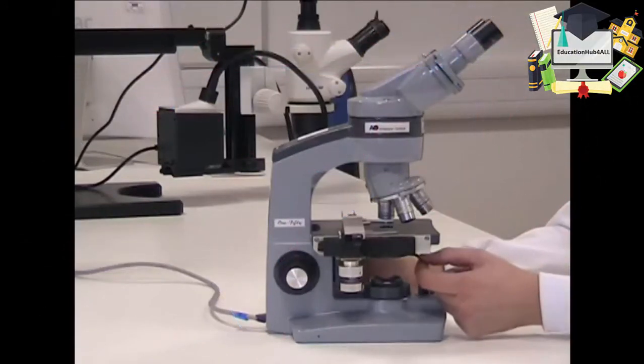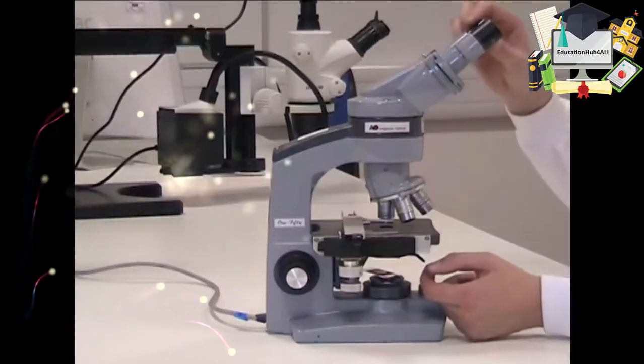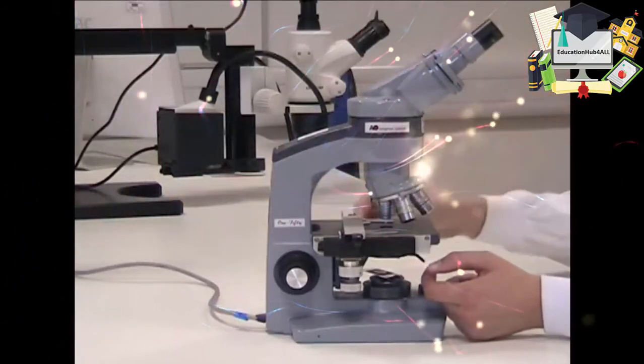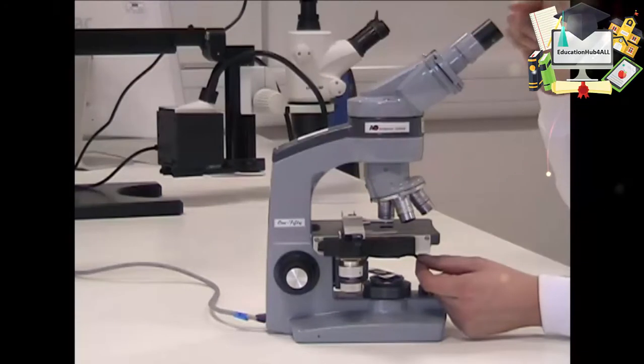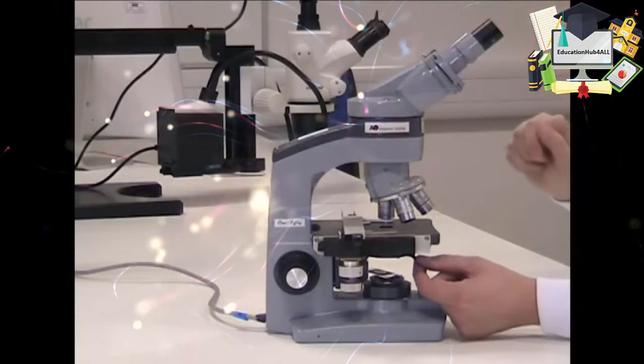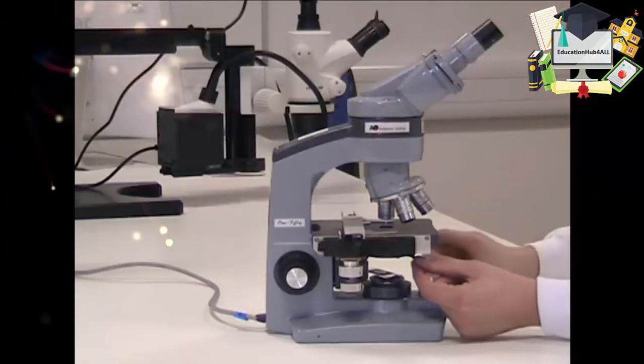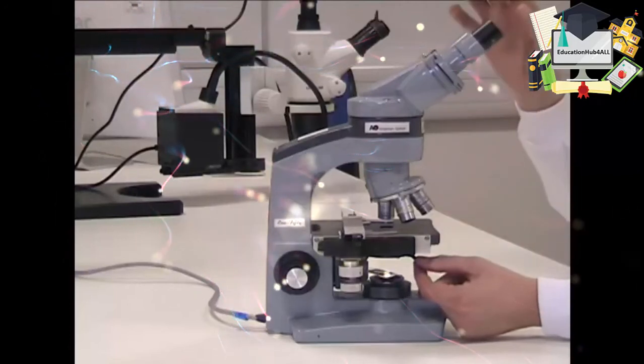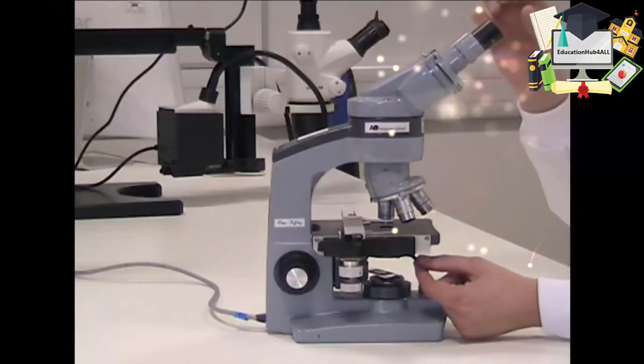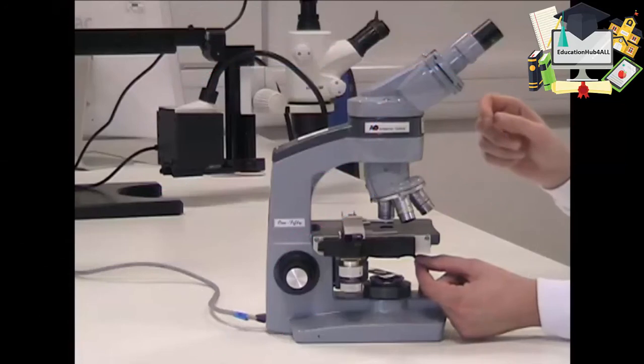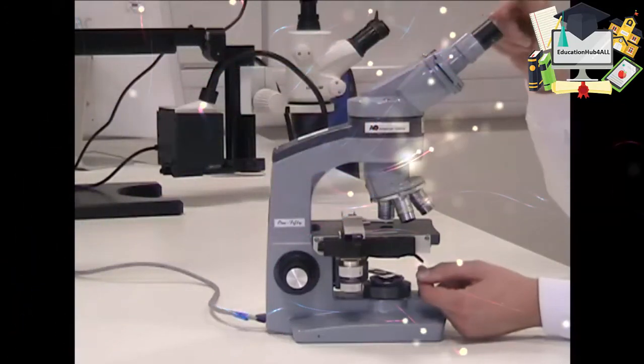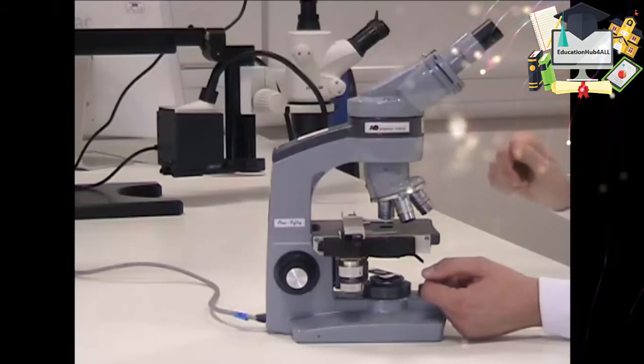Now you need to adjust the iris diaphragm lever. To do this, you must remove one of the eyepieces and look down the tube. You can see a circle of brightness down there. Close the iris diaphragm down as far as it will go and you'll see that circle of brightness turns into a small spot. Then open it back up again until it just stops getting any bigger. You can just see the edges of the diaphragm around the edge of that circle of brightness. Then you can return the eyepiece and look at your slide.